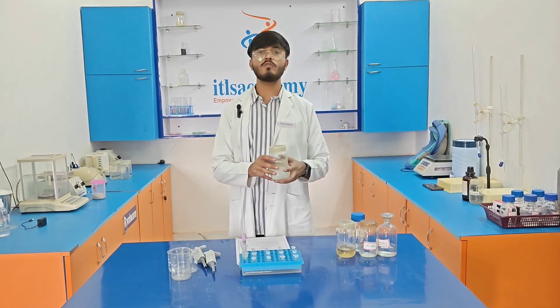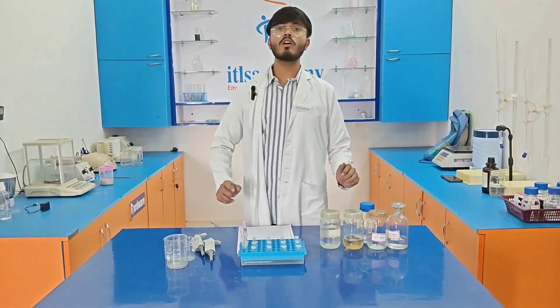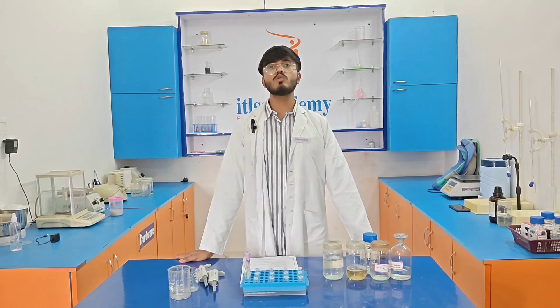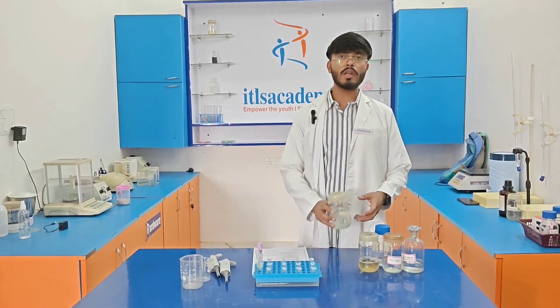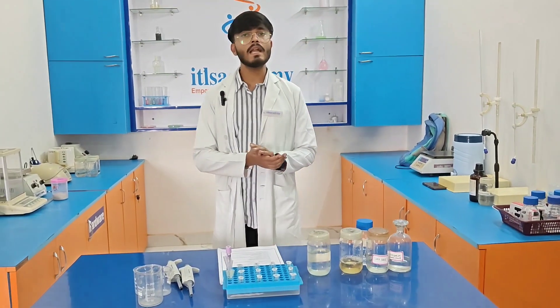The second buffer solution required is protease buffer. Protease buffer is used for the disruption of proteins present in the human blood sample. The composition required for the preparation of protease buffer is sodium chloride, EDTA, and distilled water.